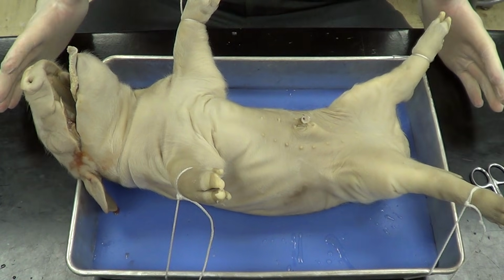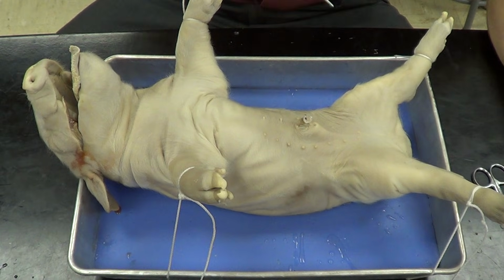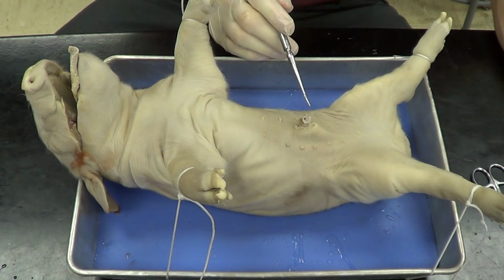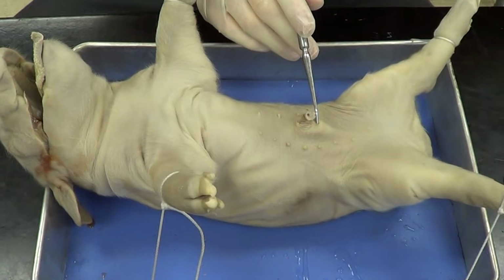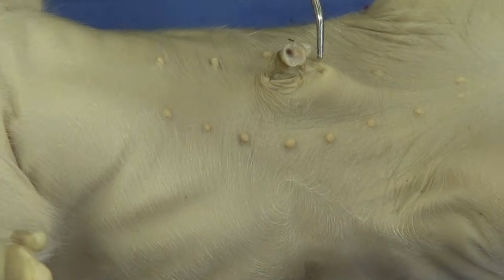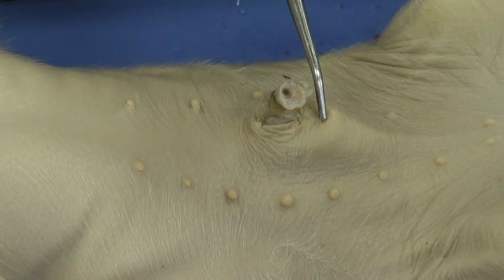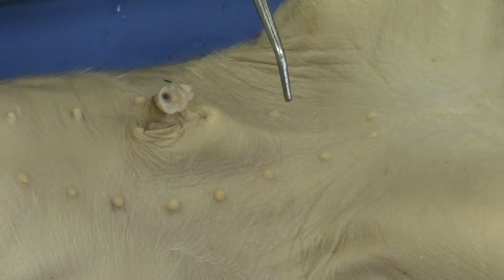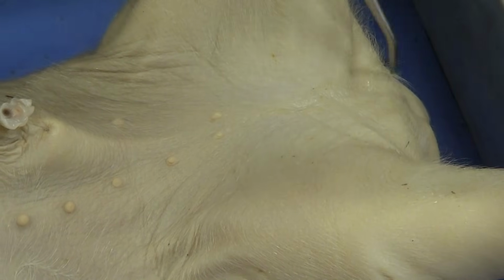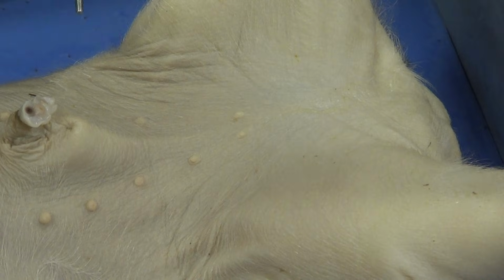Now let's go ahead and start with the external anatomy. First of all, what I would like you to notice is that this is a male pig. And the way I know that is there's an opening right here below the umbilical cord called the urogenital opening. If this was a female pig, this would not be here. This opening would be more posterior near the anus, and it would be called the urogenital papilla.